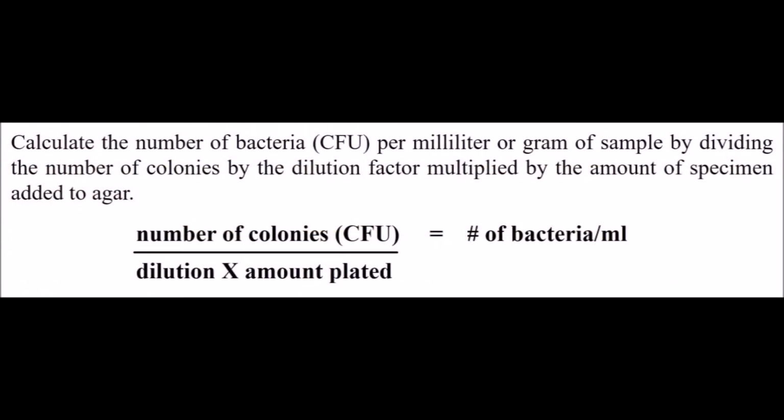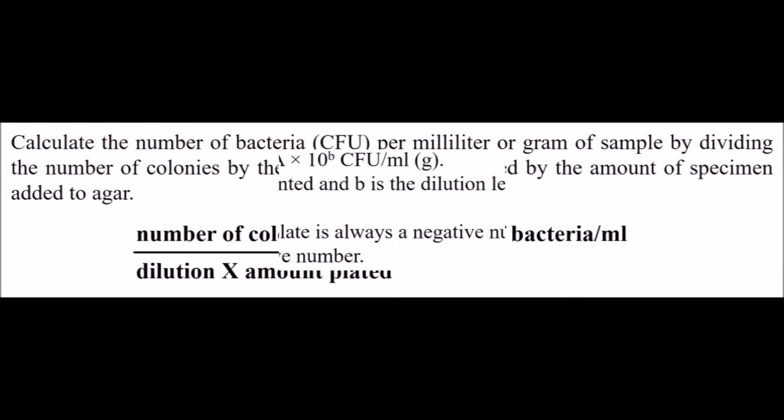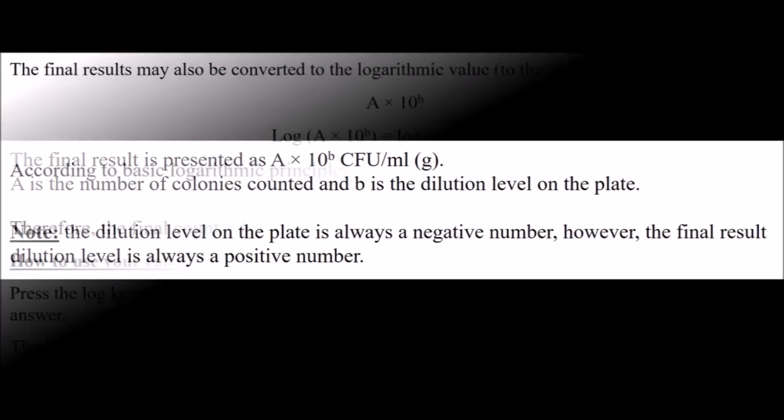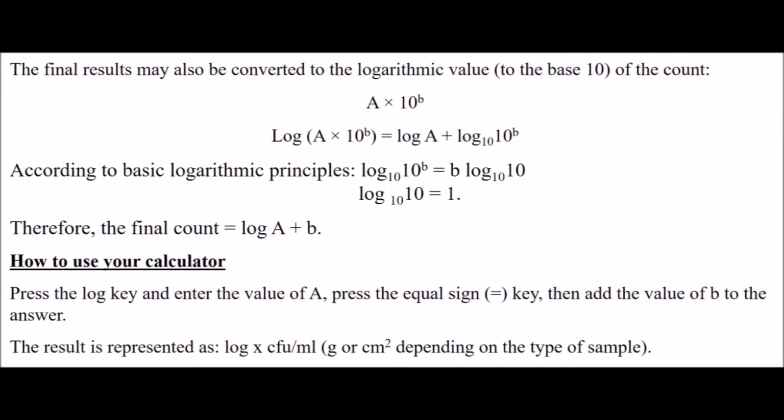Now calculate microbial numbers in the standard form using the formula above. Do this for both selective and non-selective media. You can then convert the final count to the log format.